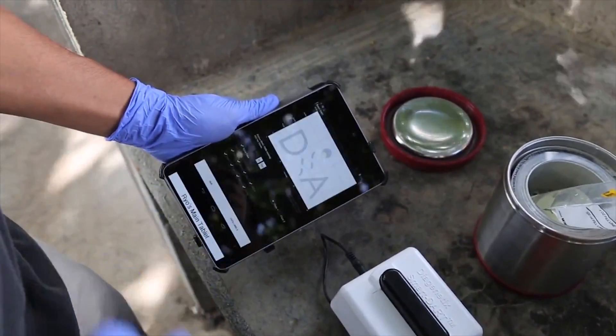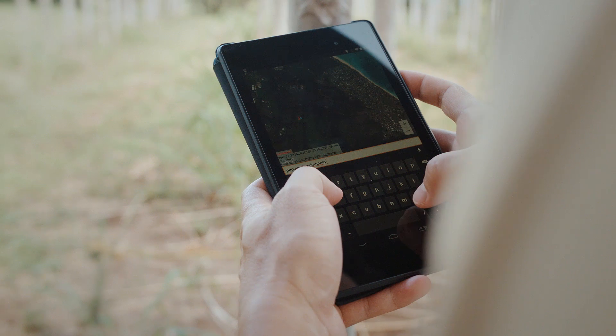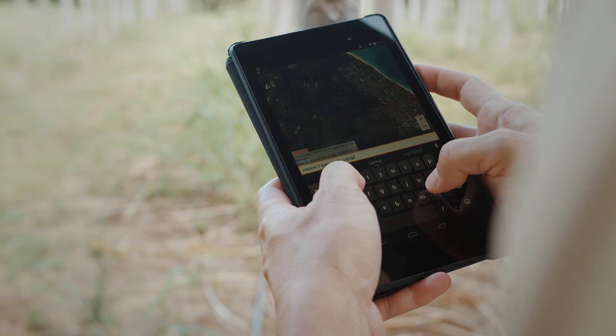Our Android-based app controls it and provides real-time results. It enables you to record your location and instantly share your results with collaborators and colleagues.